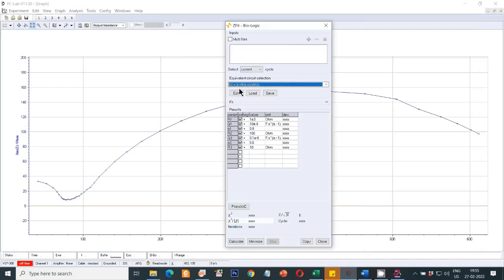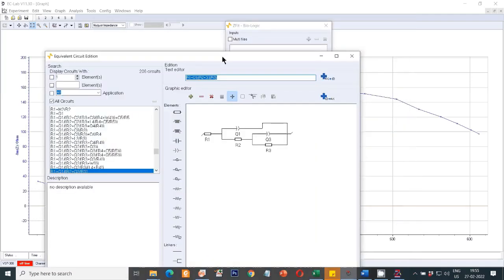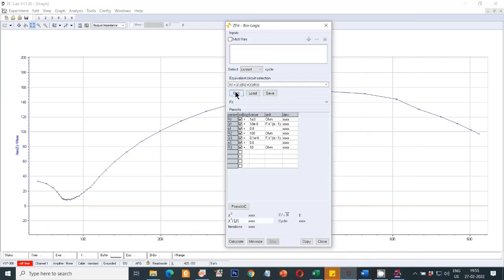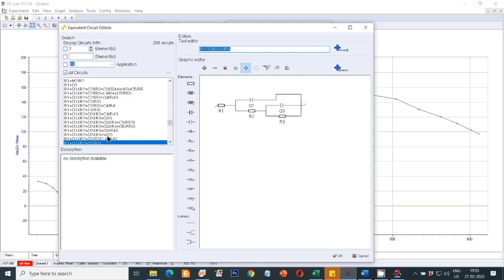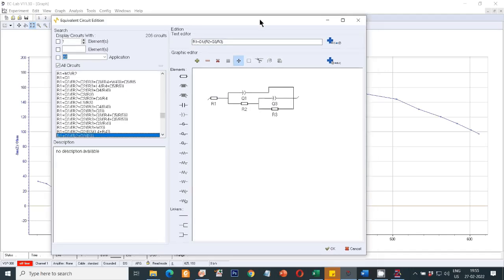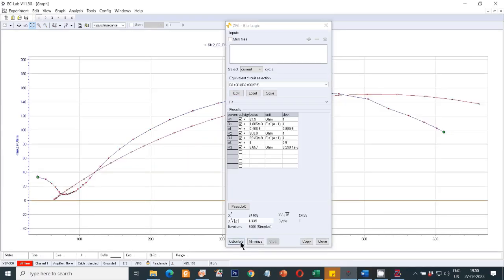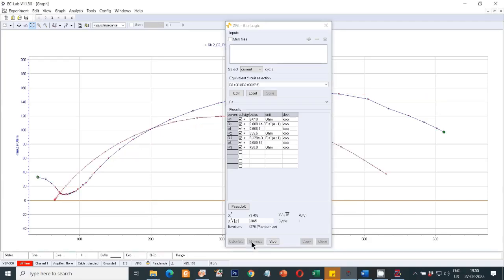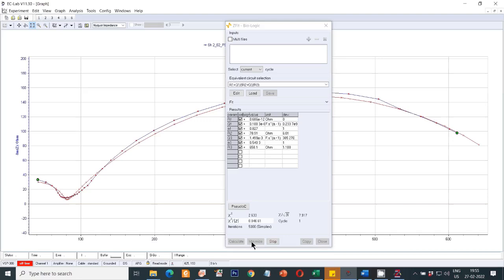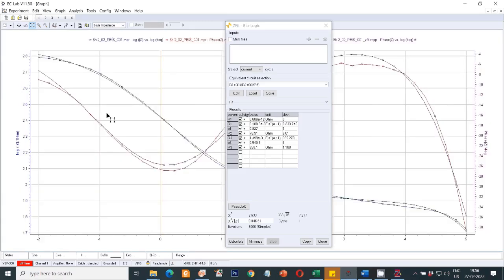To fit in EC Lab, go to Analyze and select the Electrochemical Impedance Spectroscopy option, then select Z Fit. Then go to Edit to select the equivalent circuit — a box will appear where you select your required circuit. I selected the appropriate one and clicked OK. Then click Calculate and Minimize repeatedly until the fitting is perfect. Now it is perfectly fitted — this is the Nyquist impedance fitting. You can also check the Bode impedance fitting, which is also quite good.